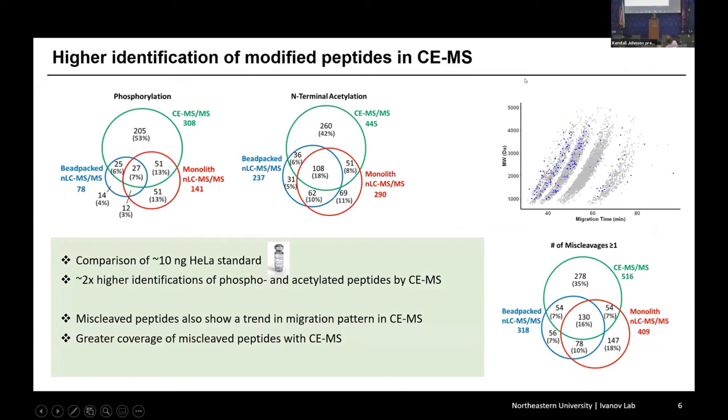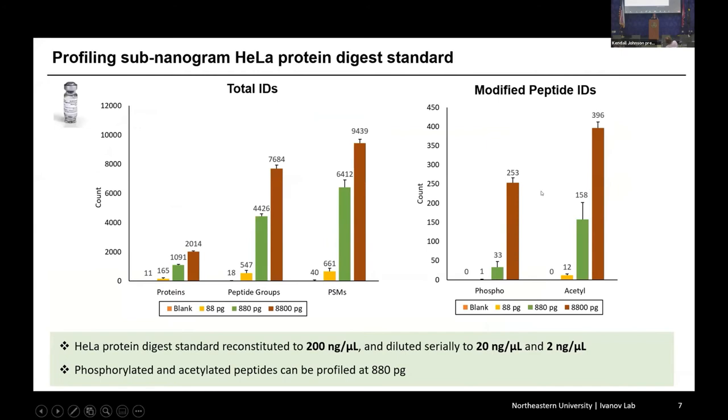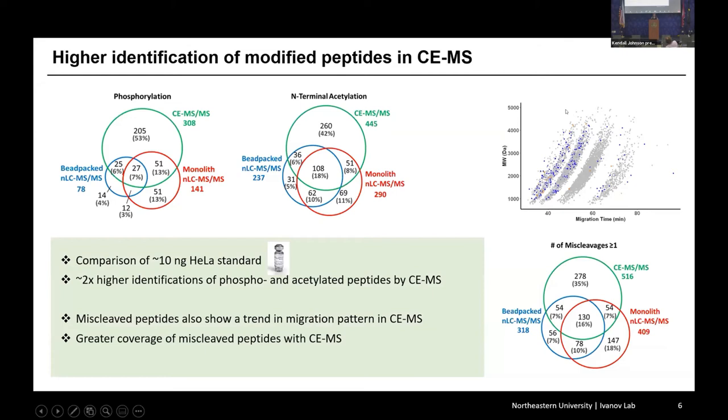Additionally, looking at some other peptide qualities that are causing some sort of migration trend in CE, I've noticed that the number of peptides with one or more miscleavage sites is much higher in the CEMS dataset. And this ion map, the peptide map here, shows that most of these are migrating earlier in the migration time, which is expected as these peptides will typically be more basic.